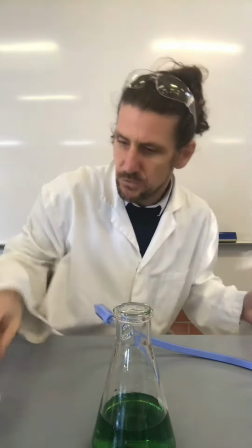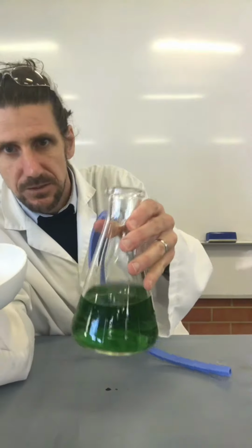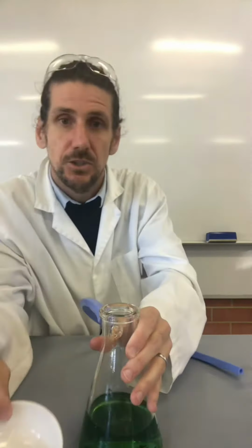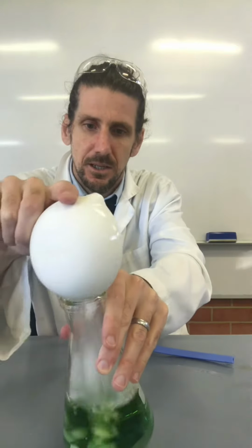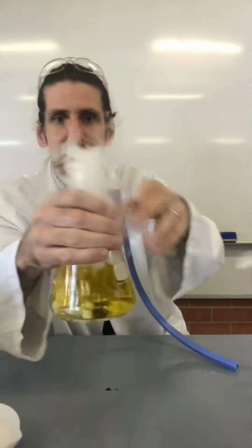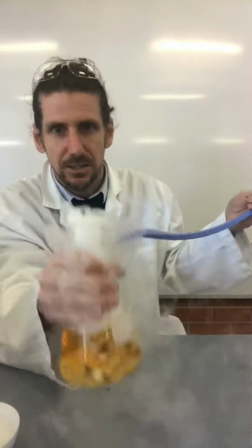Another great demonstration with dry ice is when you take some dry ice and have a flask full of universal indicator, which is green, it's neutral. As soon as you add the carbon dioxide dry ice to it, bubbles start to form and you can see it changes to a lovely yellow and you get the nice cauldron effect as well.